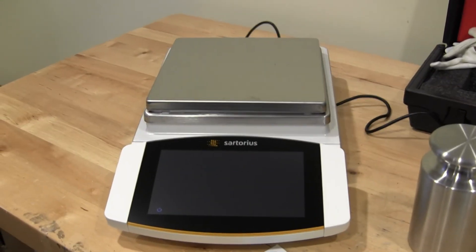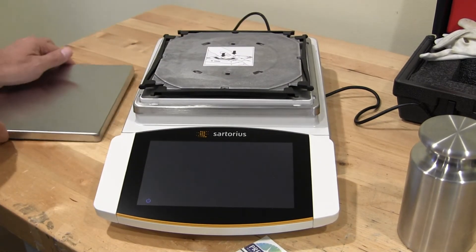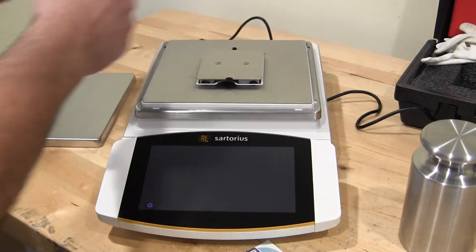To remove the pan support, there are two buttons you have to press and then it rotates off.